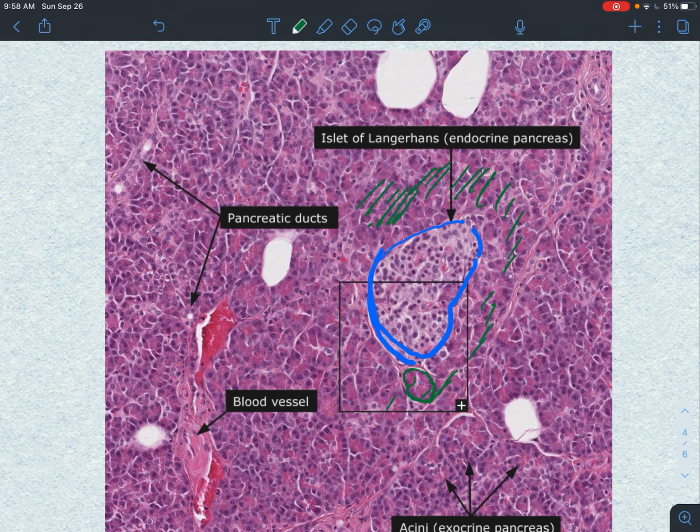See that circular kind of, that's the acini right there. Here's another acinus right there. Right? When we say acini, right, that's what we mean. And so here you can really see that there are these cells that are circling each other, making that acinus right there.